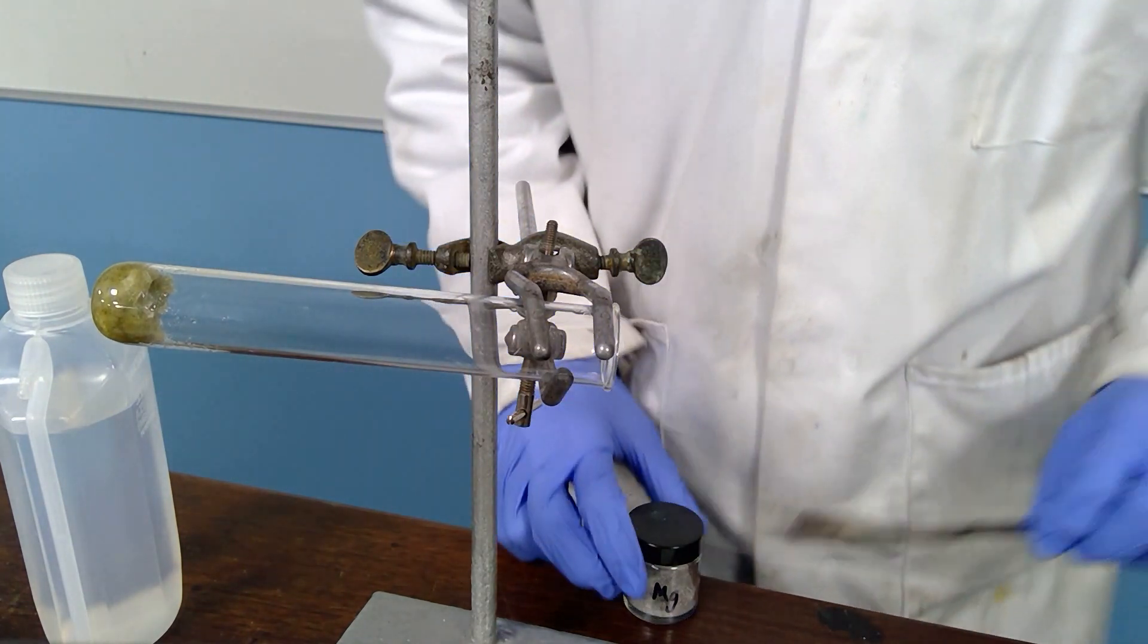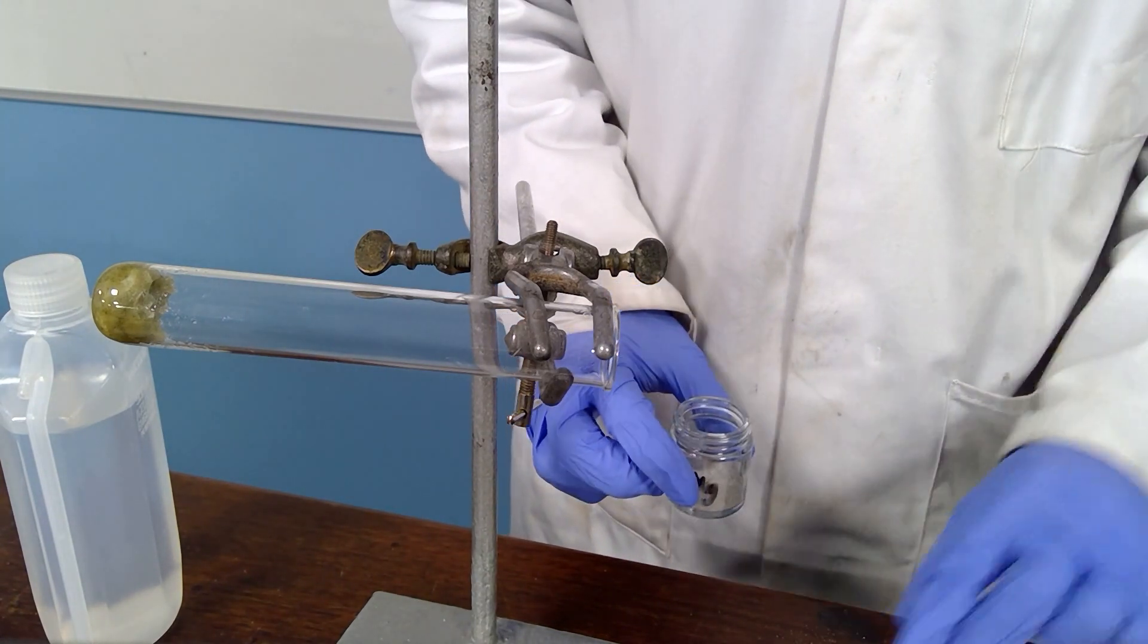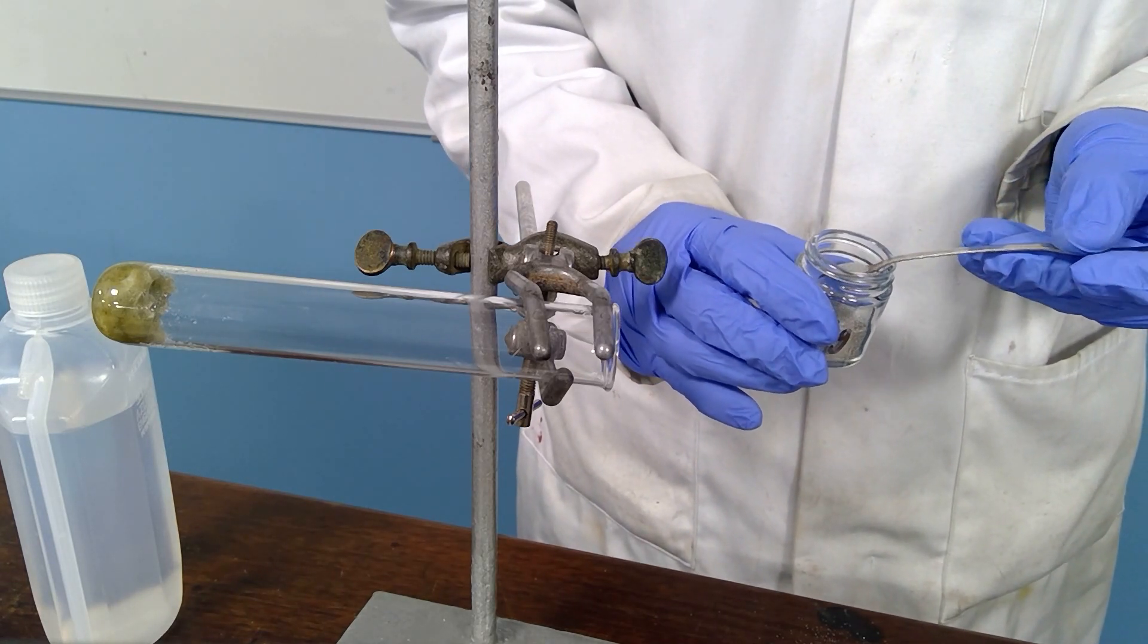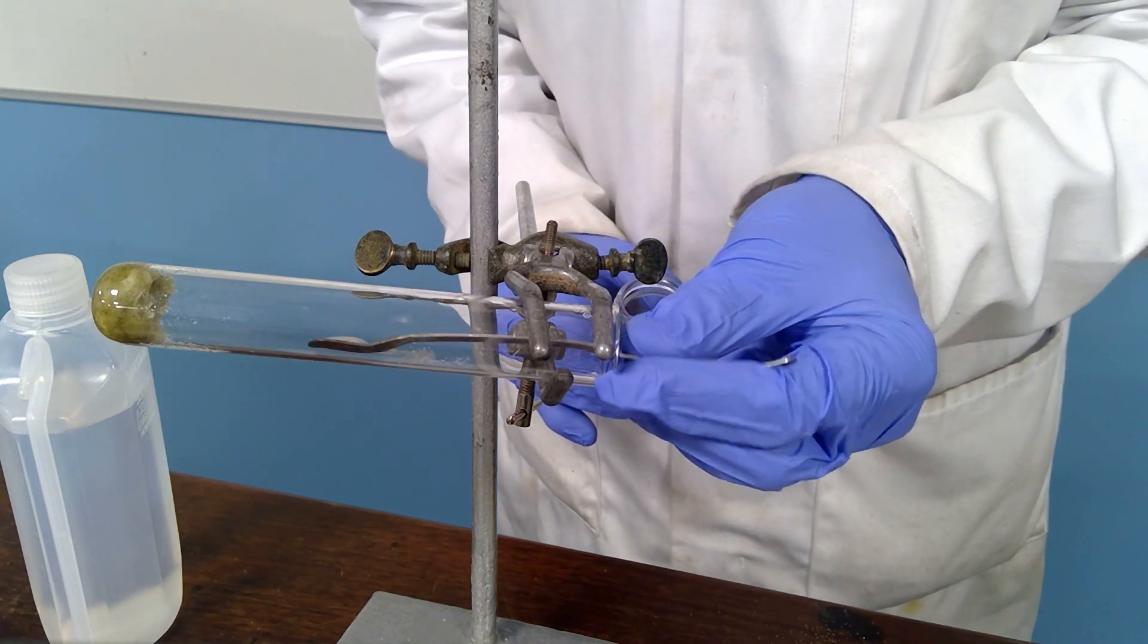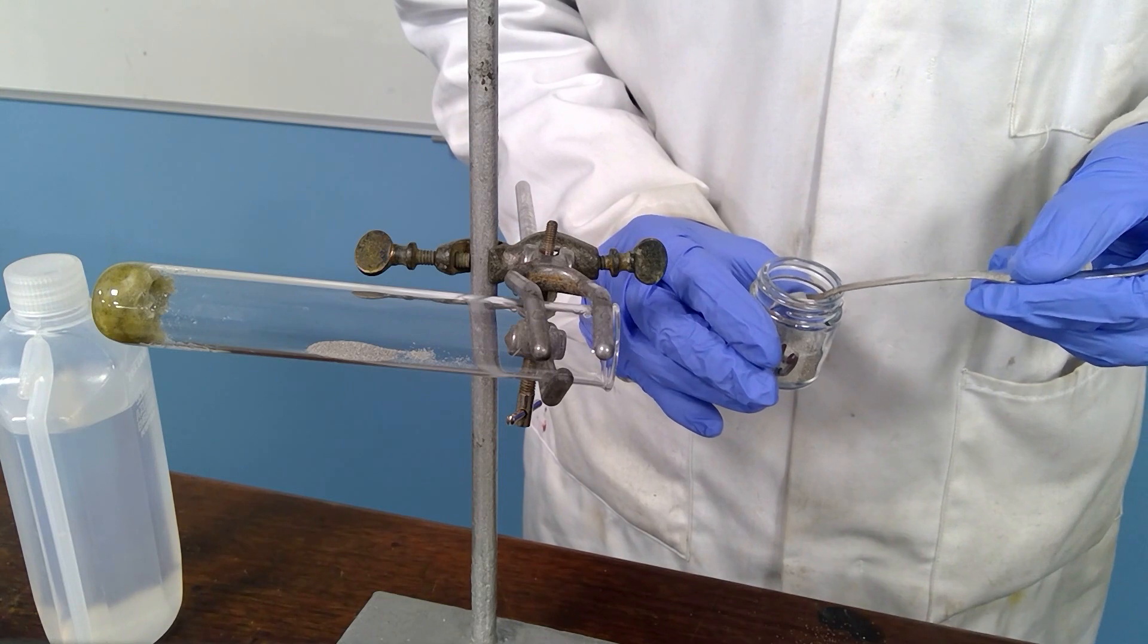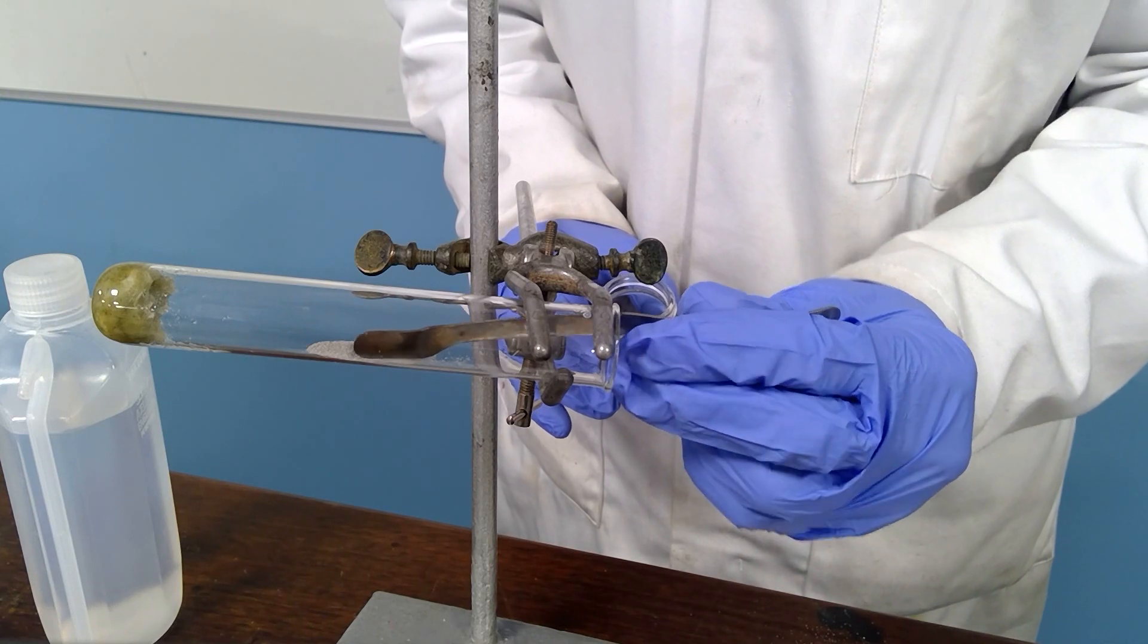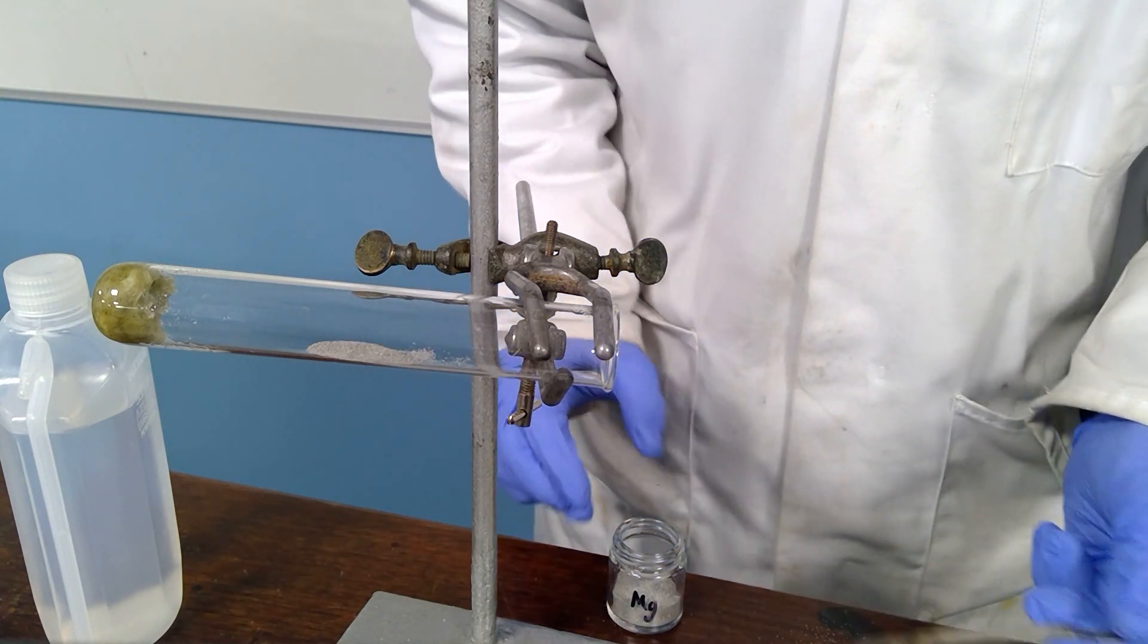I then place some of the magnesium into the tube, roughly halfway along. This magnesium is in the form of magnesium powder with a high surface area and therefore should interact quite nicely. There is the magnesium.